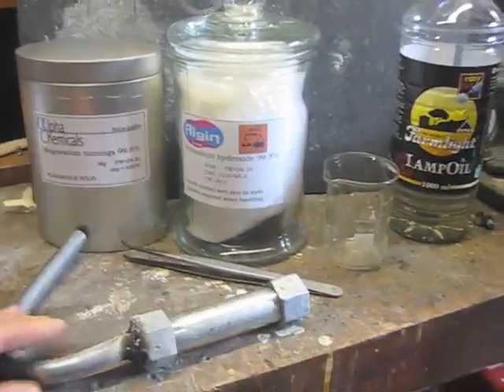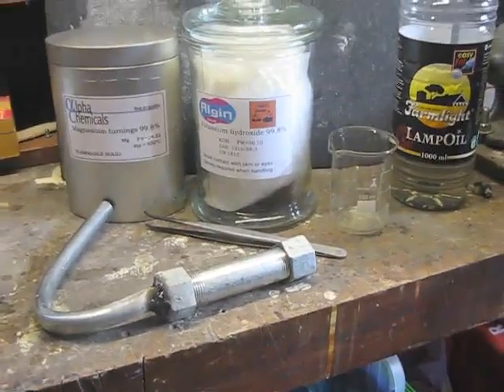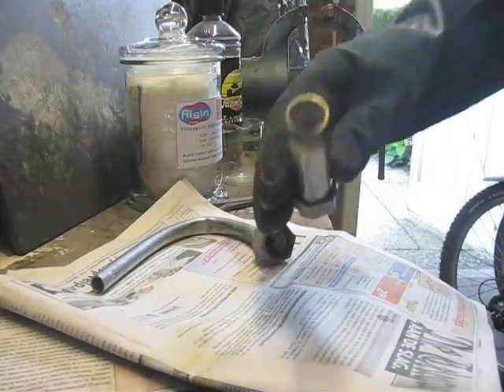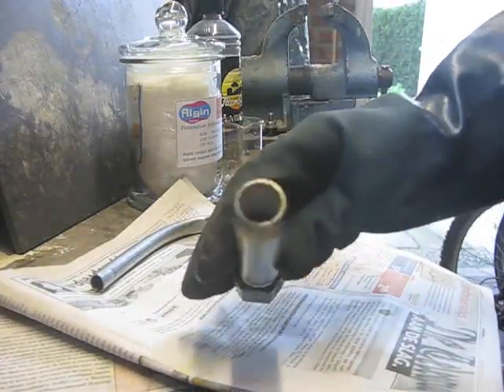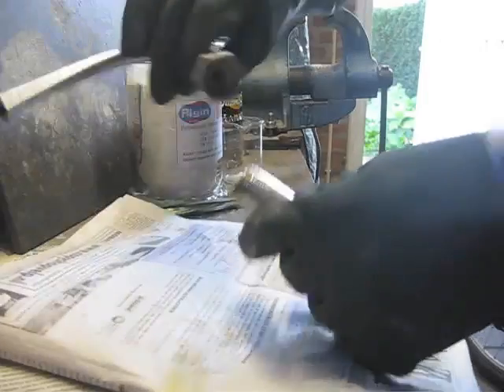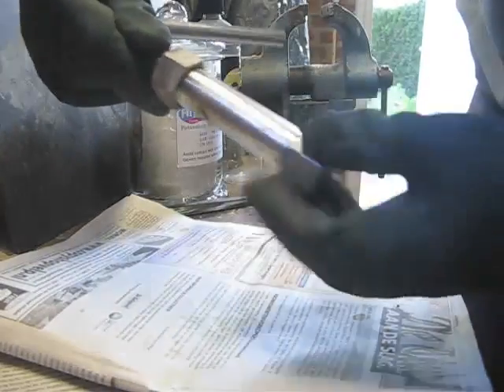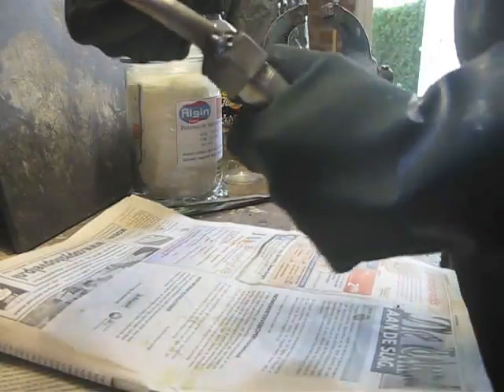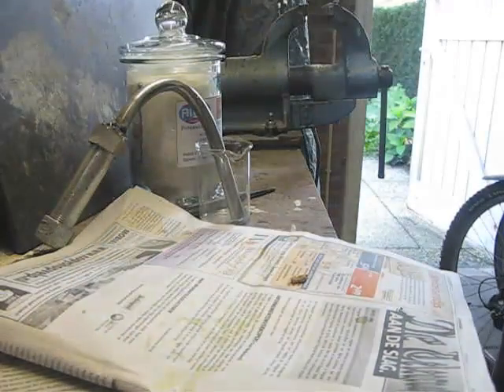This is the retort — I just unscrew this, put the reactants in it, and then heat it up until the reaction starts. The chemicals are mixed now, as you see in the tube — you see the mixture of the reactants. Now I close the tube and screw the nozzle on it. Now I put it into the lamp oil.